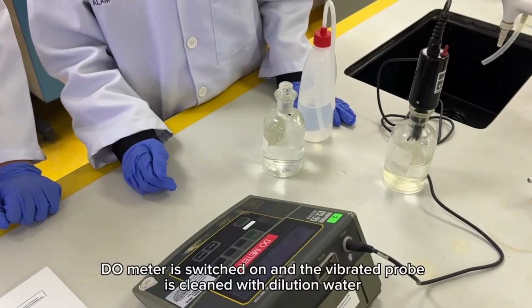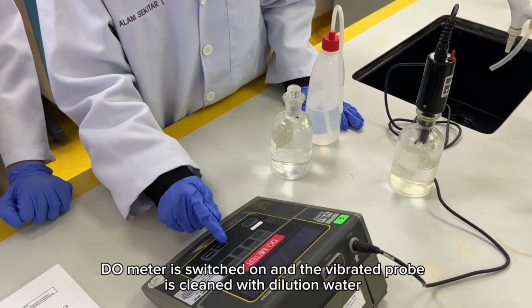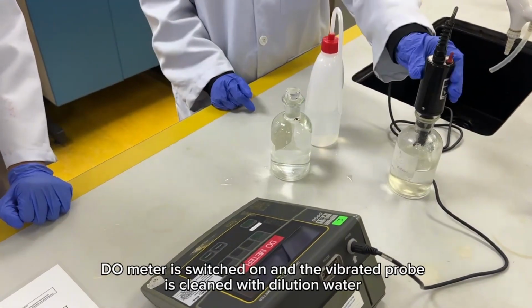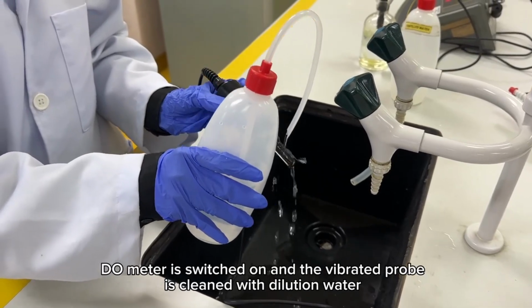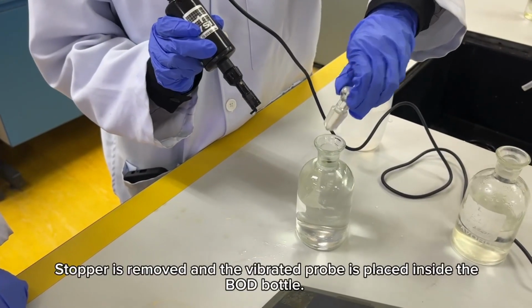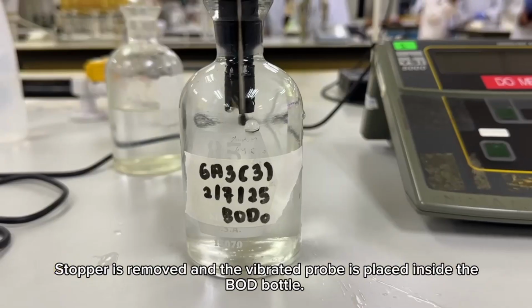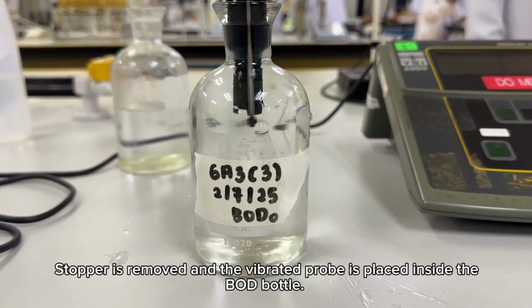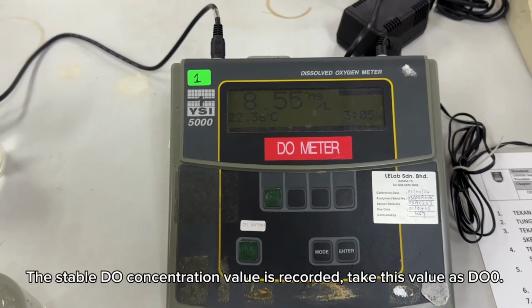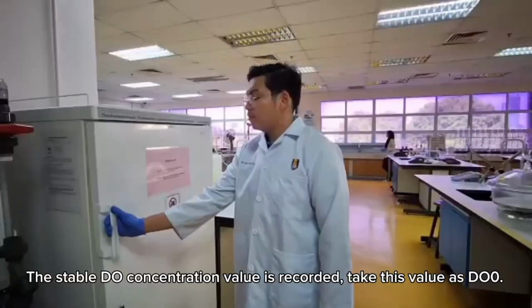The DO meter is switched on and the probe is cleaned with dilution water. The stopper is removed and the probe is placed inside the BOD bottle. The stable DO concentration value is recorded. Take this value as DO0.